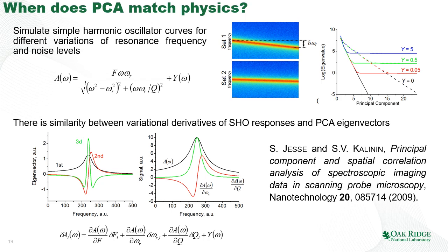So most of the time, principal component analysis is a great way for the exploratory analysis of your data, but it doesn't offer any physics connections. And if it does, it is worth paying attention to it.